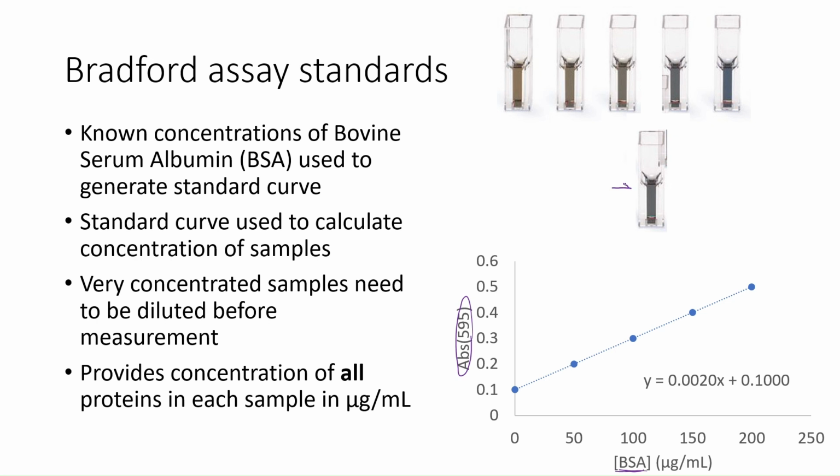Usually even just by looking at your sample in the cuvette, the color of the Bradford reagent can help you visually place this particular sample as being a little bit less blue than this standard and a little bit more blue than that standard. It's somewhere in the middle of them. And the way this curve is mapped out, the most brown standard is down here at the lowest concentration. Our 5th bluest standard is up here. And so the 3rd and 4th ones where our unknown is between are at these two. And so our unknown probably is maybe about this blue in color, right?